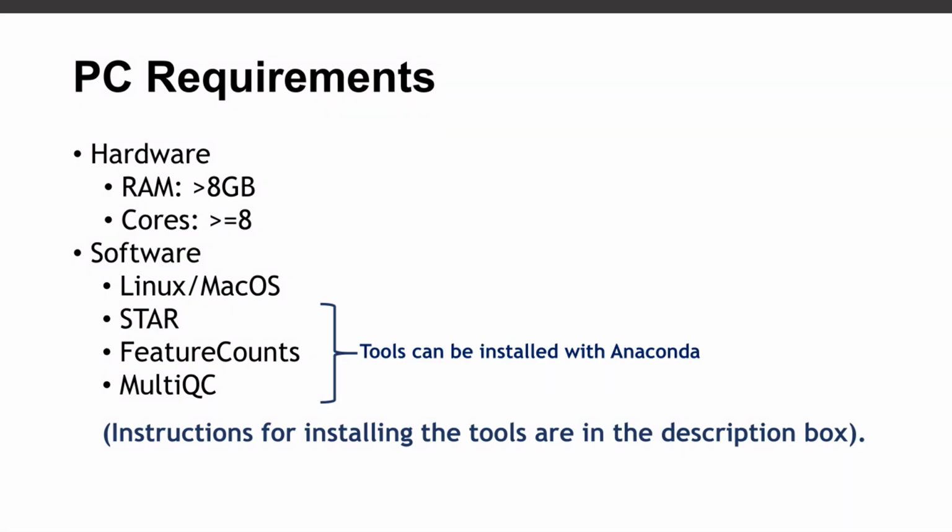Alternatively, you can use Anaconda to install these tools. So if you have Anaconda installed, you can use that to also install the tools. That's fine. I'll show you how to use Anaconda to install these tools, by the way. So just check the description box. You'll find all the necessary information that is required in order for you to follow and reproduce this tutorial. So let's get started.